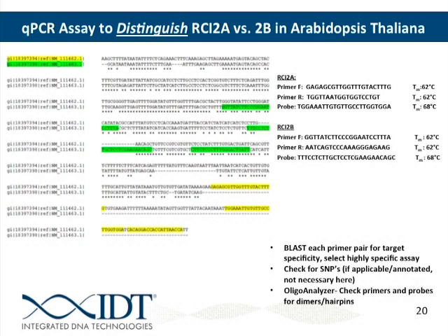So if we like that, we can click that button up there to order. Right, so if that assay checks out, then you can, from PrimerQuest, I think if you're logged in, there's a button on that previous slide. Here we go. So you can select that and add the assay to your cart. Okay, yes, maybe it's all three. That will get you both of those primers and that probe.